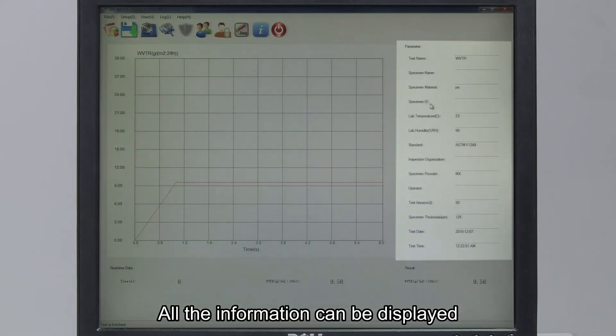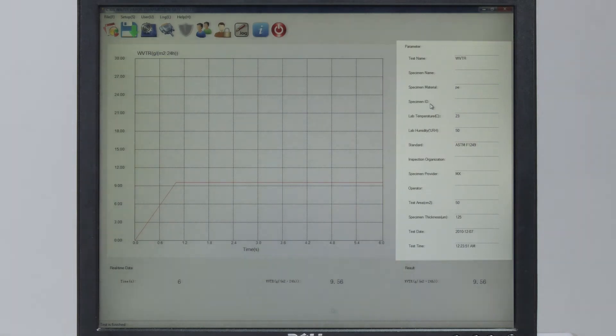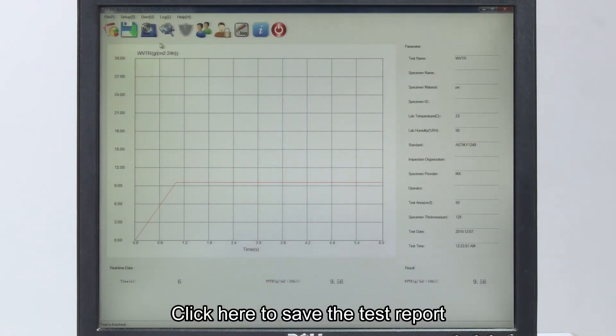All the information can be displayed here on the interface. Click here to save the test report to a specific folder.